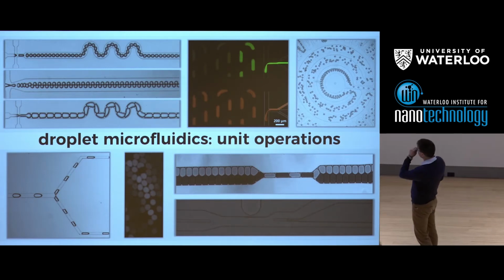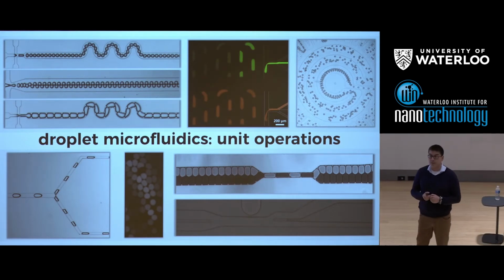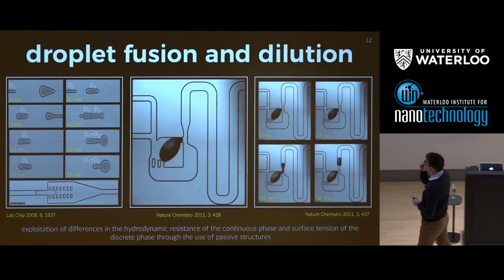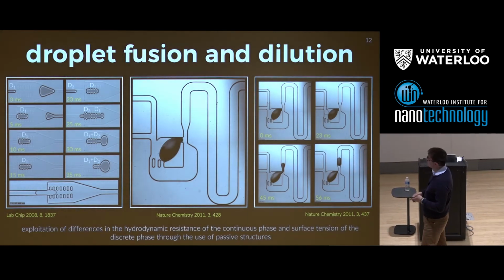Now, in our hands, we can't work at exceptionally high flow rates, but using a very simple detector here where we can look at the fluorescence of a droplet, and as it moves downstream, use an electric field to move it in an upwards or downwards direction, we can get this to work at between 2 or 3 kilohertz. So again, we can start to think about doing analytics on the droplets that we're making, but still at kilohertz frequencies.